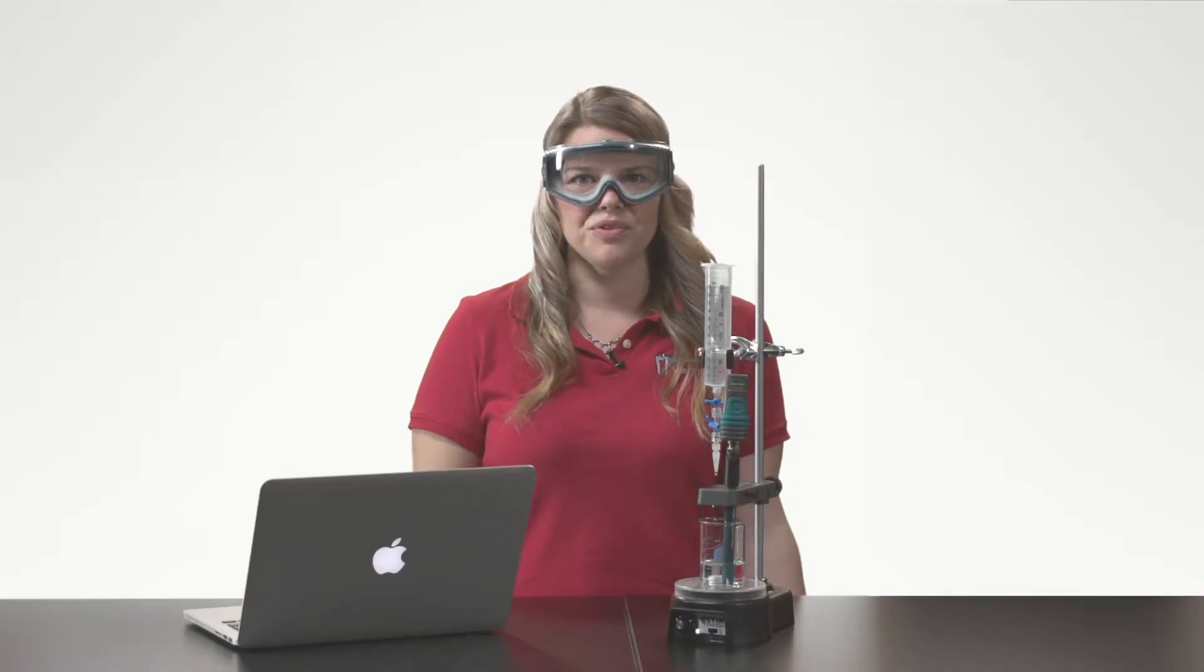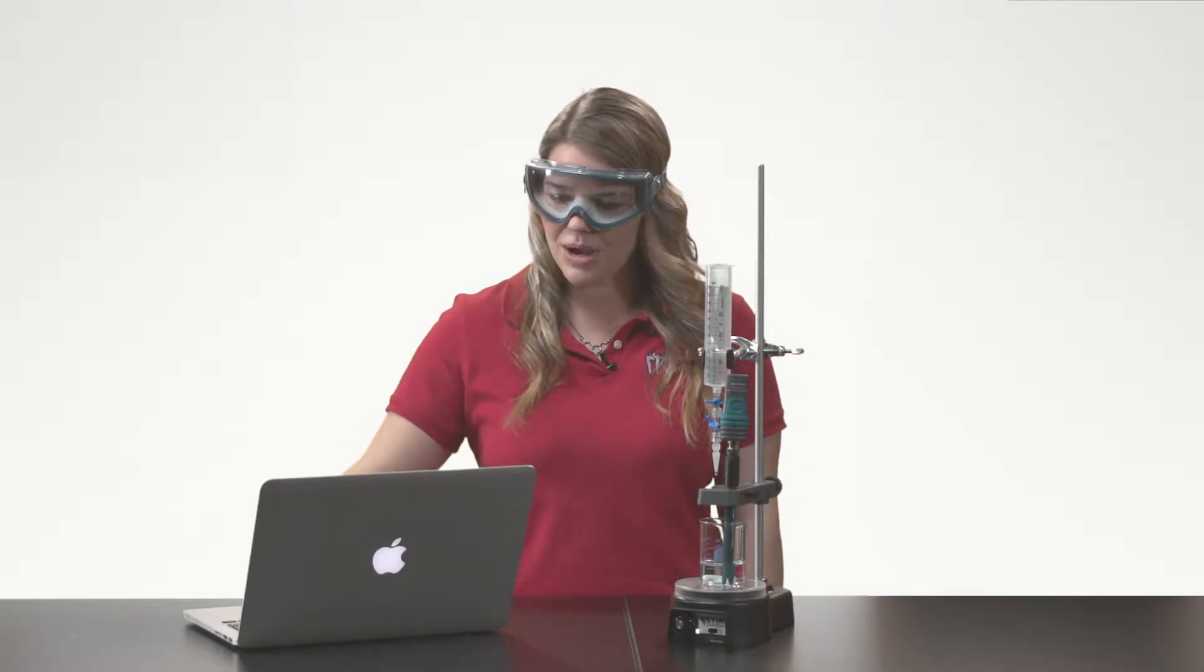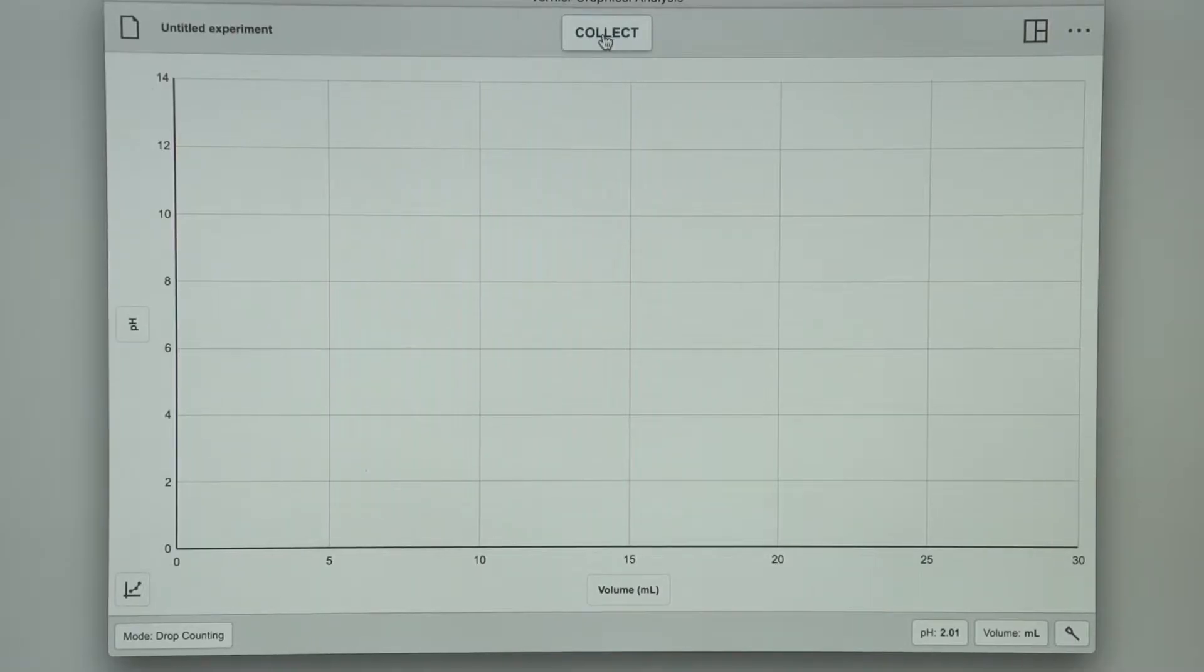Since my titration is all ready to go, and the Graphical Analysis 4 software has auto-identified my drop counting mode of data collection, I can go ahead and press the collect button, and it will wait until the first drop passes through the slot.